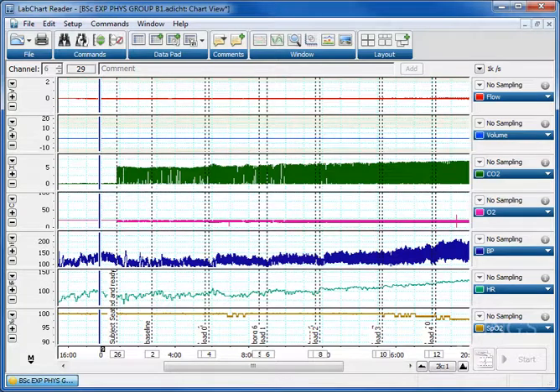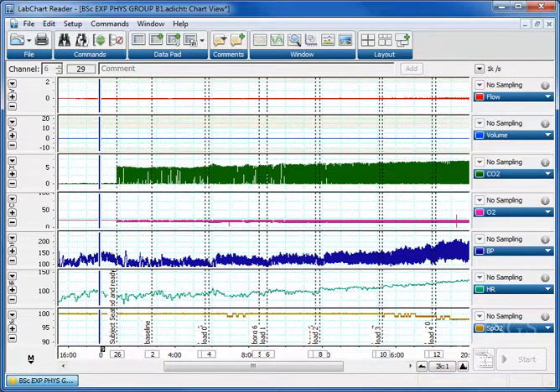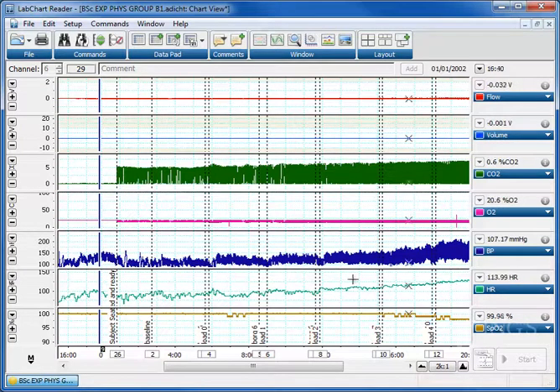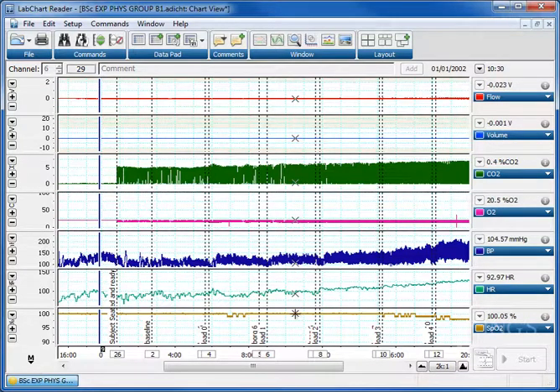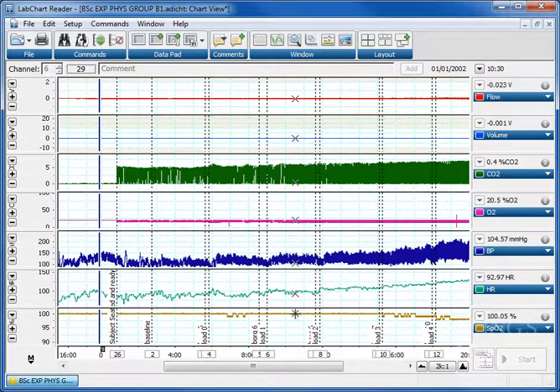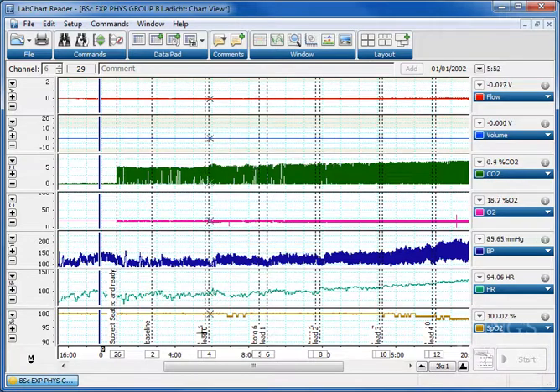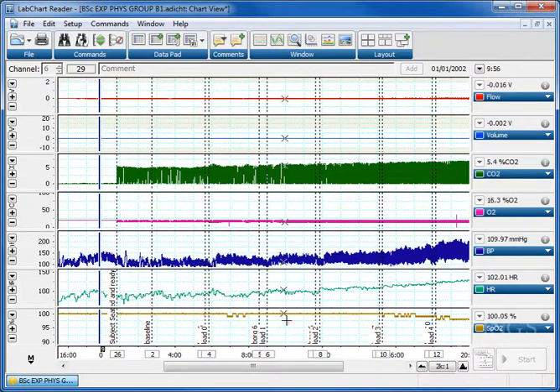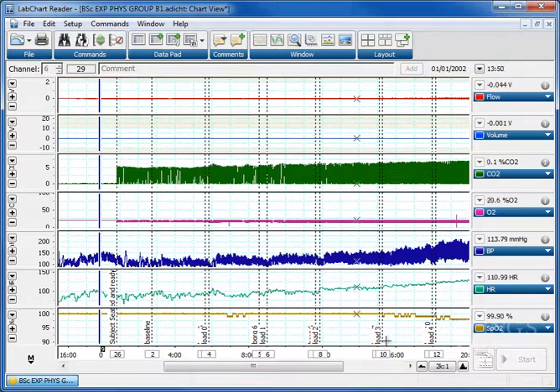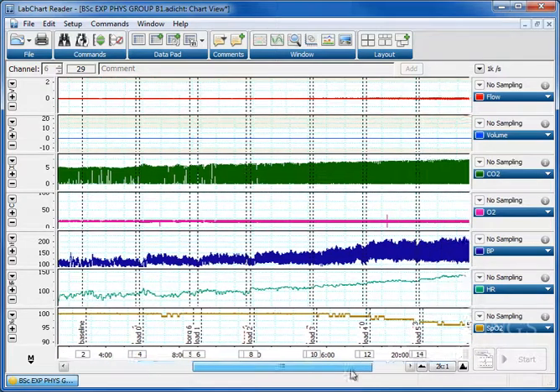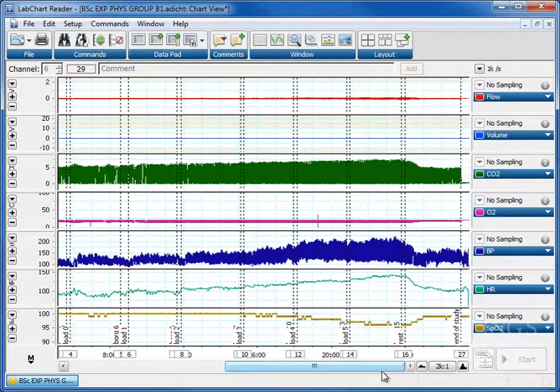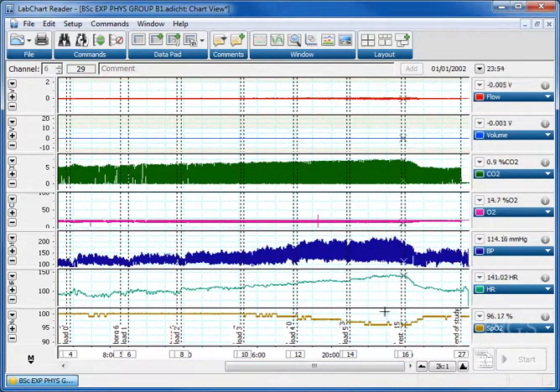I'm going to quickly show you using the data we have here from the dynamic exercise practical how to select data automatically. This is entirely dependent upon you having correct comments. You can see here we've got comments written at baseline, load naught, load one, load two, load three, etc., up to the end of the experiment.